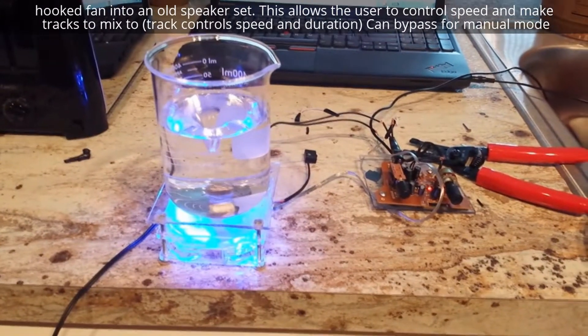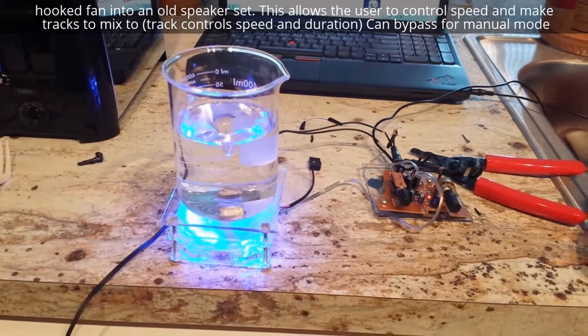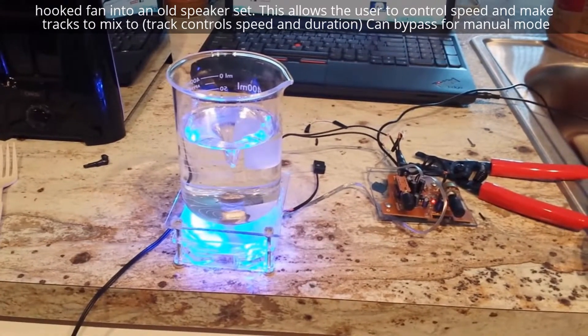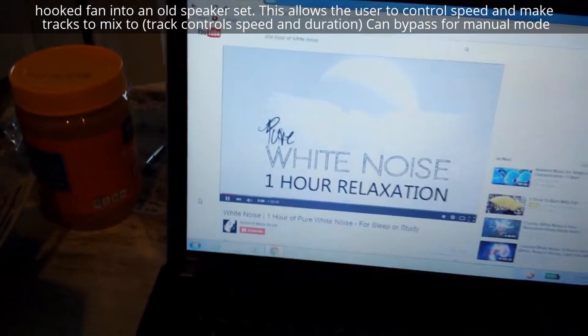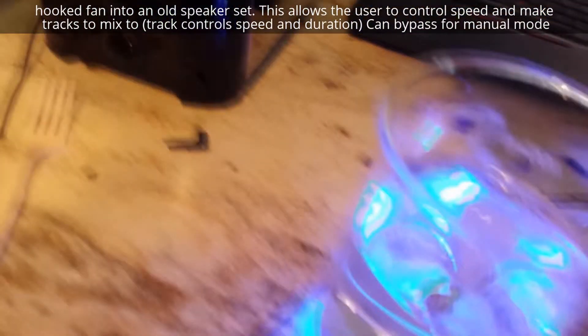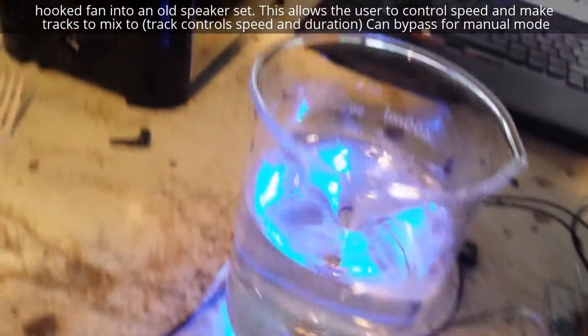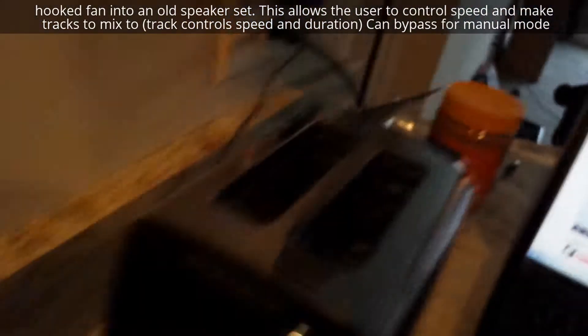I was using the speaker for the control. What I did — I tied the volume to make it so the fan goes faster or slower. So right now I just have YouTube up with one hour of white noise. If I decrease the volume, the speed decreases. And if I increase it, the speed increases.